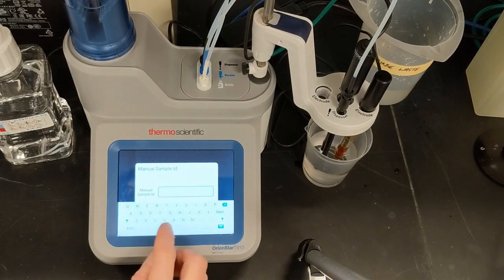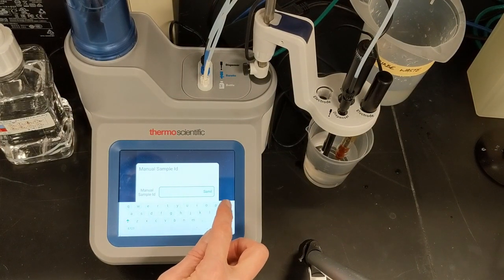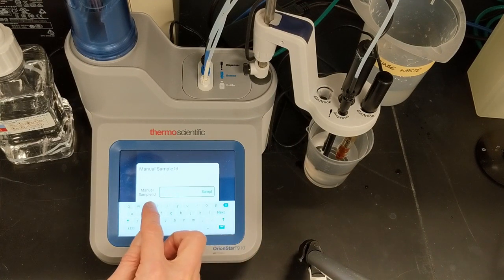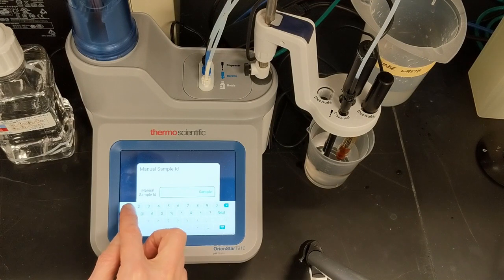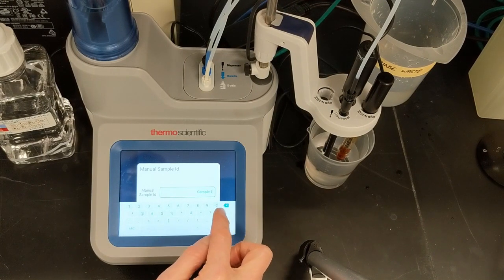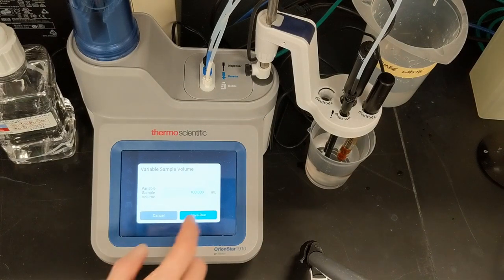Since I've chosen the Manual Sample ID option, I can type in the name I want to be saved in the log. I'll just use Sample 1. The sample volume is 100 mL and I touch Save Run to start the titration.